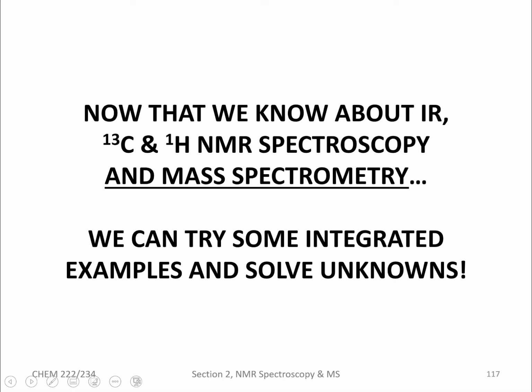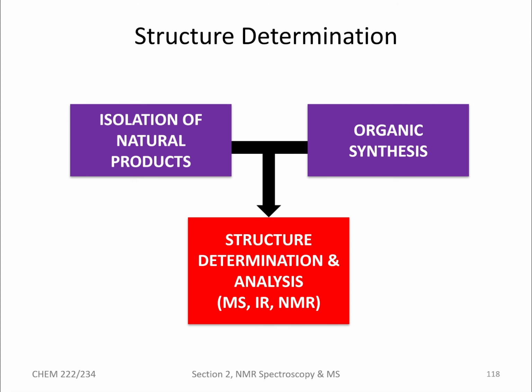All right, so the whole point of learning about mass spec is that it complements our other spectroscopic techniques like IR and NMR. It tells us how we get the formula, and it can also give us some additional ideas about functional groups and isotope patterns that can help us in tricky situations. But realistically, it's better to just have that full picture.